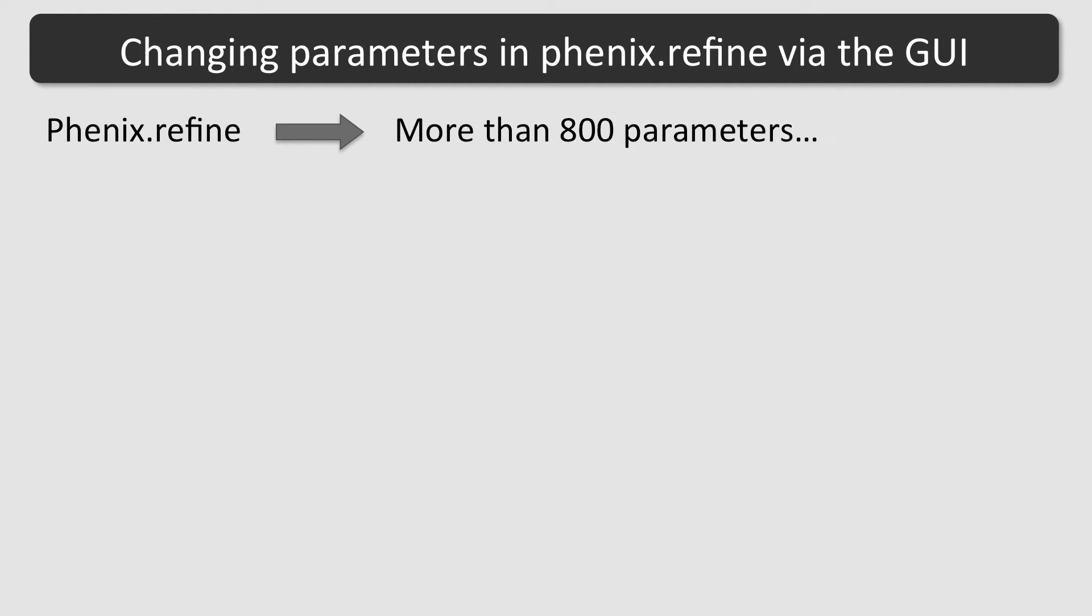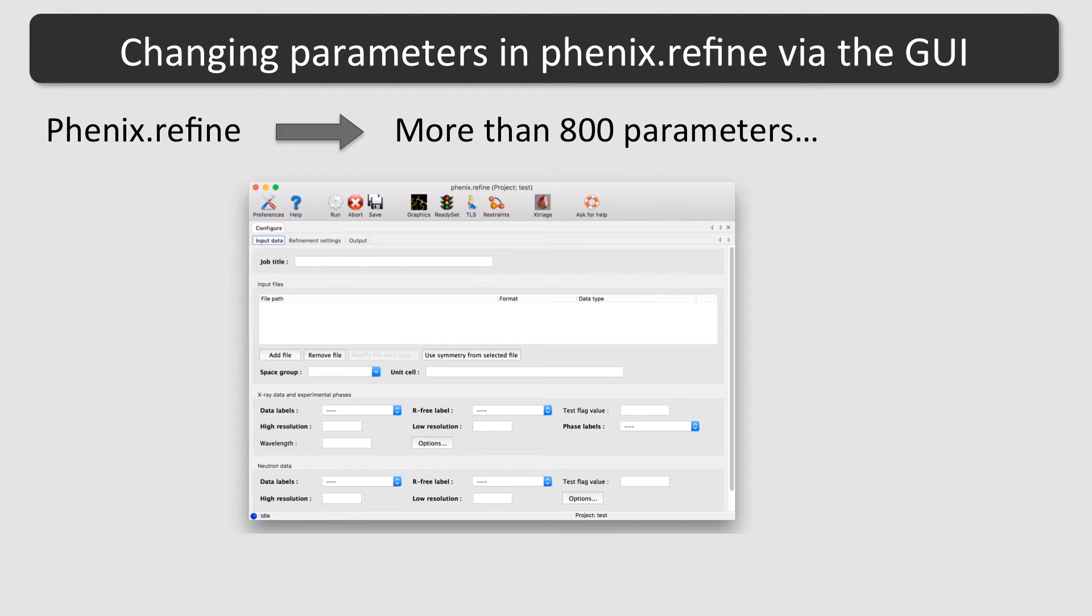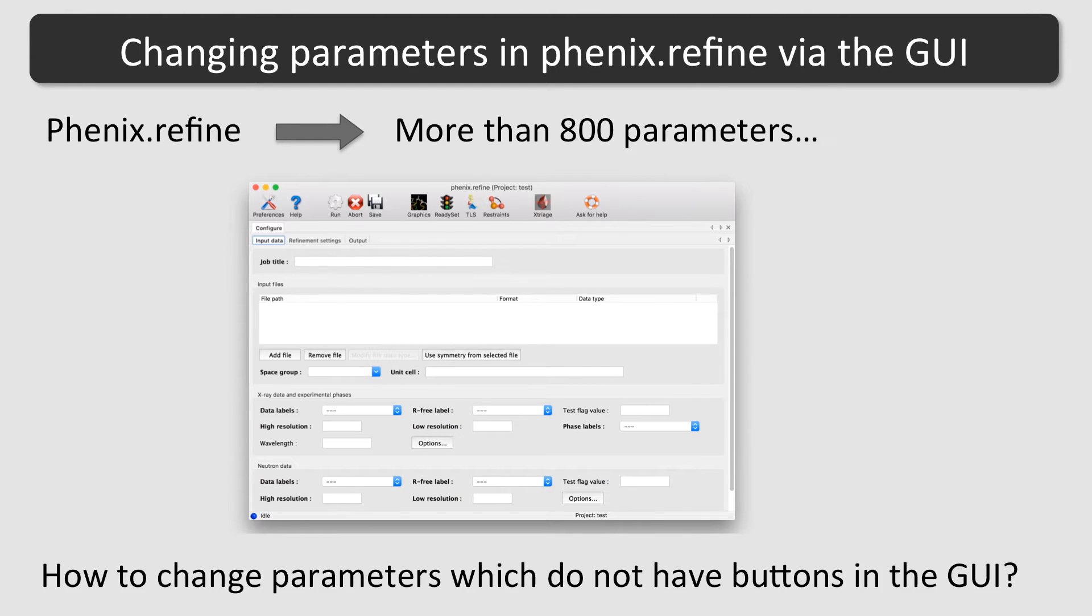Those which are often used are available as buttons or input fields in the graphical user interface, but obviously it is not possible to squeeze all of them into the GUI window. Some of the parameters are therefore available by other means. I will now explain how to change a specific parameter via the GUI.